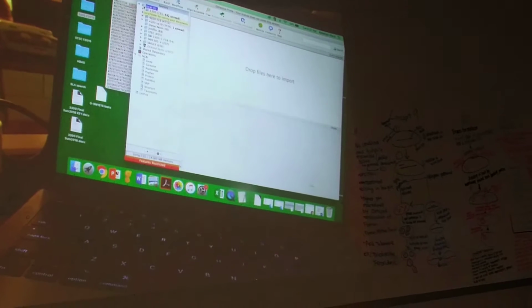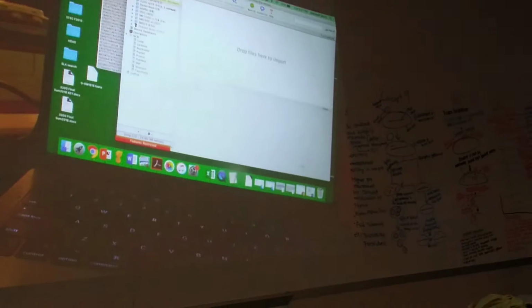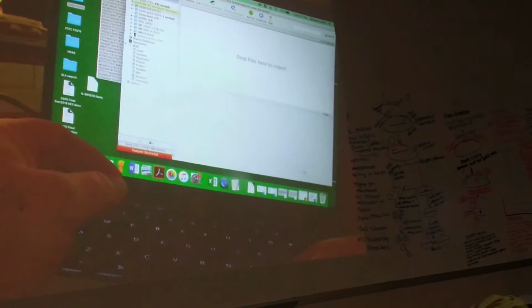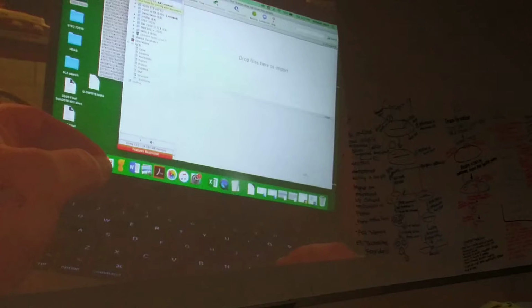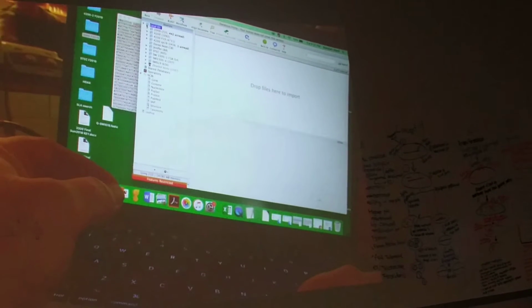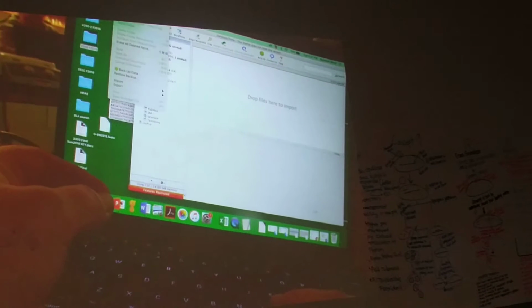You already have Mega on your computer, don't you? Yeah, that's fine. You're going to go into Genius and select the orange one, and then select local. So I did Control A, Control C. You're copying the whole thing.